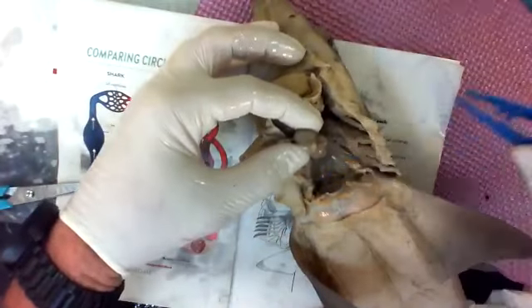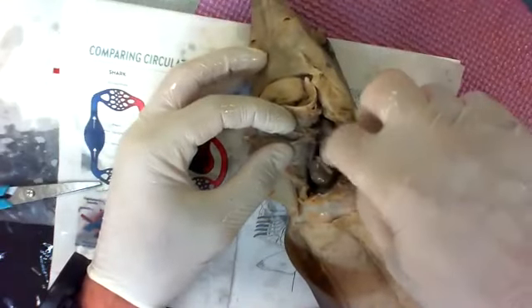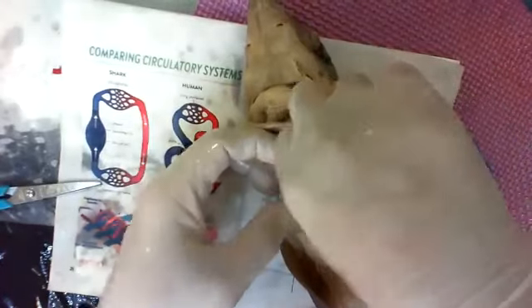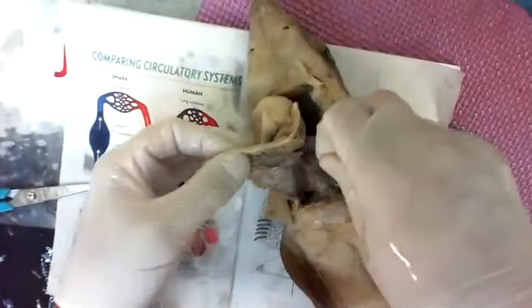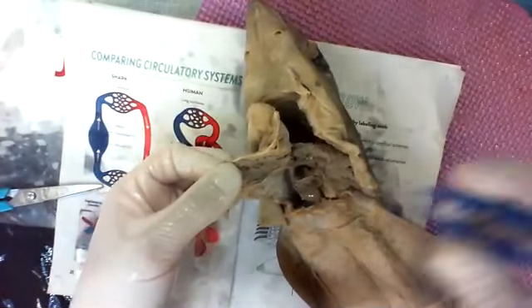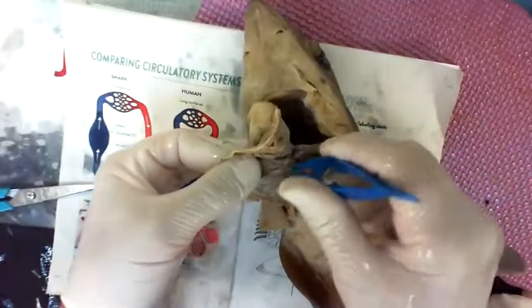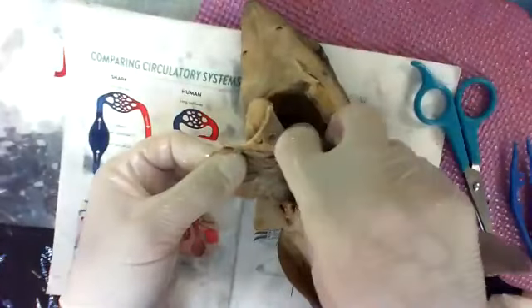And lift it up. You see the cavity there. So there was a wrapper around the heart. It was with that conus and that membrane, all of that. It wraps around. If you come in for a stem and we do hearts, you'll actually see the membrane on the hearts. Oh yeah. Actually, the other one that we're sending home still has the membrane around it. It's funny. My boss said, because her daughter likes doing these things, and so she had a kit for the new set. And her daughter said, "Hey, you didn't send a heart with this kit." And she showed me a picture, and I said, "Actually, see that sac there? The heart's hiding in it."